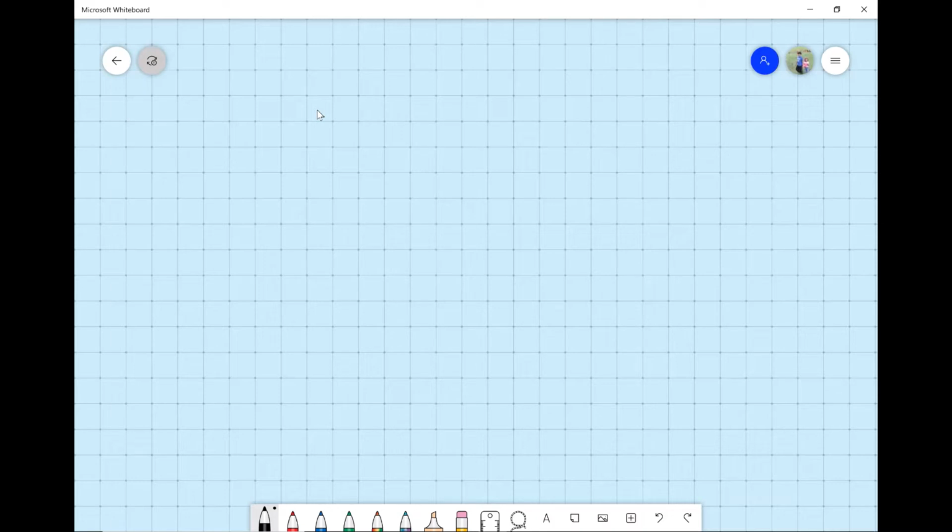We're looking at the Auger electron process, but there's another process that can also happen when electrons knock other electrons out of material. So we have an electron fired from a gun. I'm going to try to draw this neatly. And I've already made a mistake, but we'll just carry on.